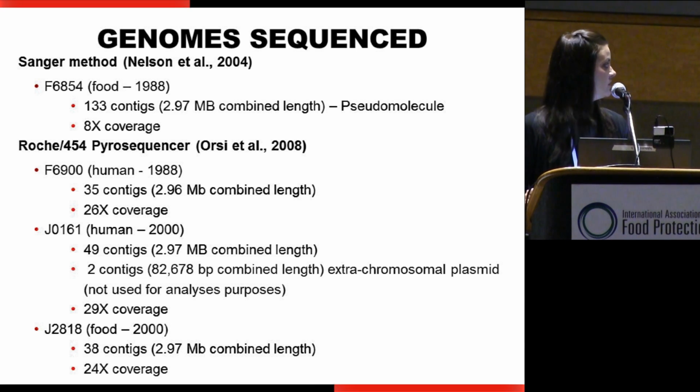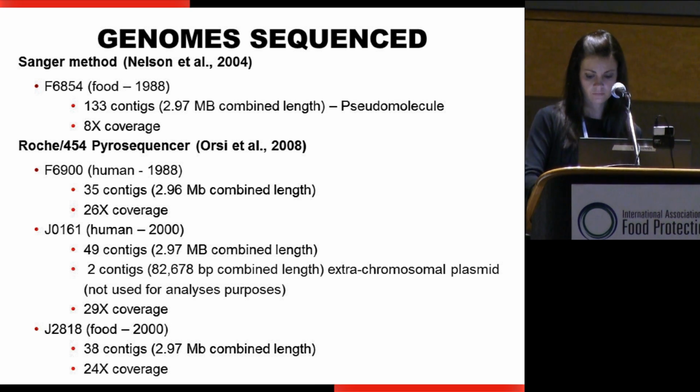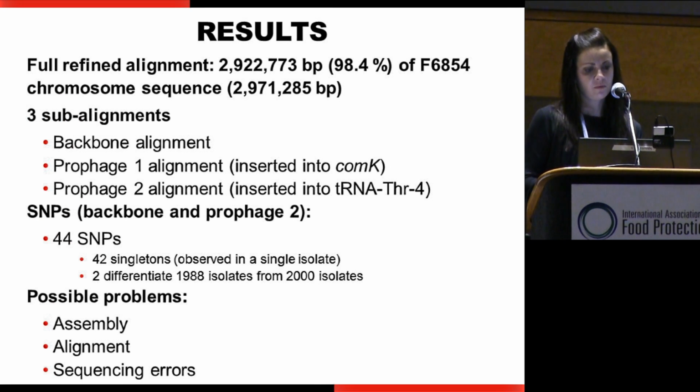data. So this is just some statistics here, and now when we do next generation sequencing, we're actually in the era of getting hundreds of fold of coverage on these genome sequences that we can assemble. So when we look, the genome sequences were very typical of Listeria monocytogenes, around 3 million base pairs.